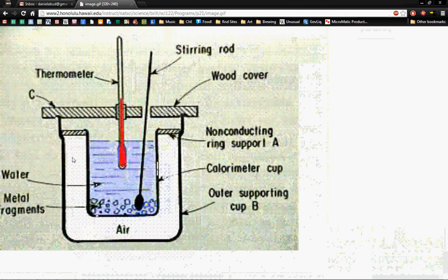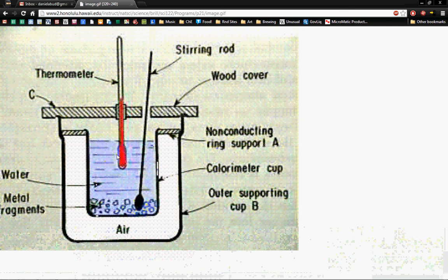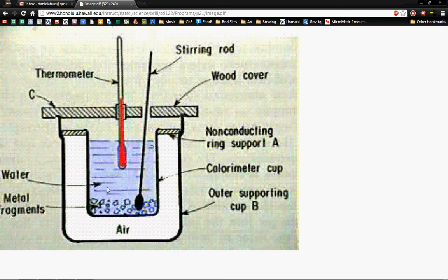So here's our thermos. And here's the liquid. And you're going to have a little stirring rod that you use to mix it up and a thermometer. And the thermometer will help you determine the change in temperature. And the stirring rod will help you make sure that the water in there is nice and mixed.